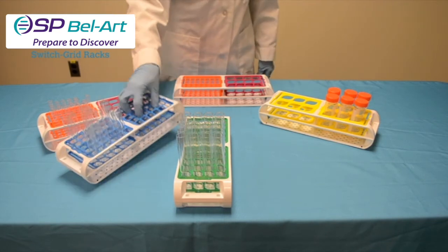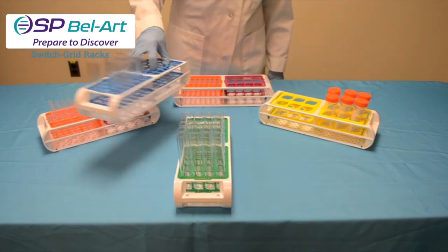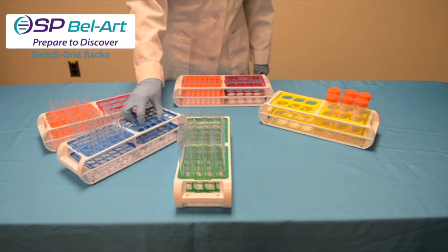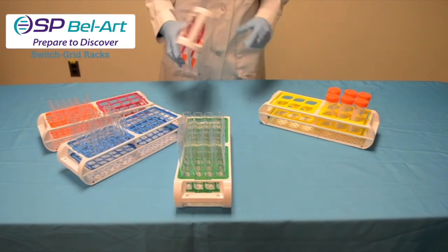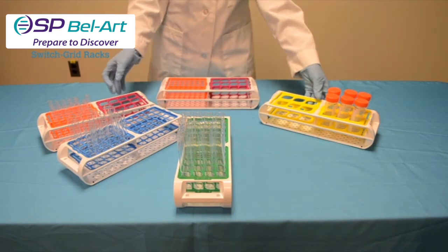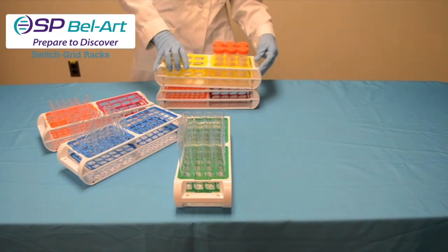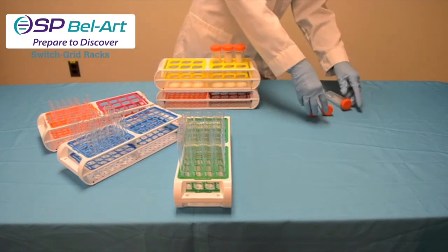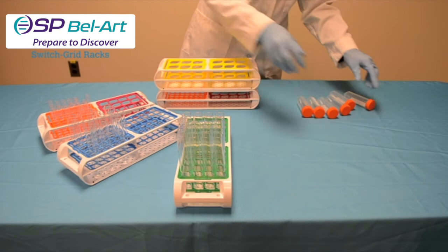Easy as they are to remove and install, these chemical resistant polyoxymethylene racks are very stable and very sturdy. Rubber feet keep racks from sliding on the benchtop and also aid in providing sturdy stacking when storing. Stacked racks will not slide around and fall all over the benchtop or in storage areas.